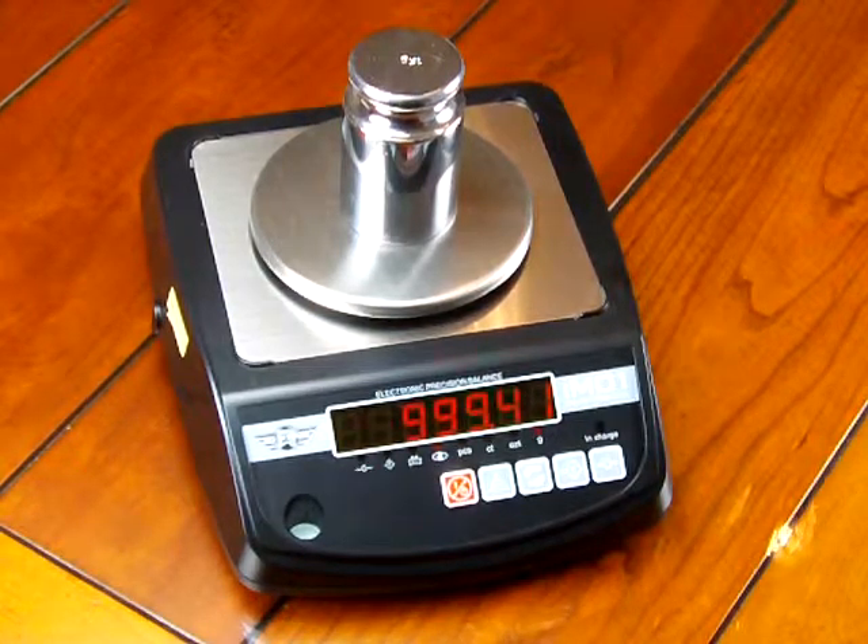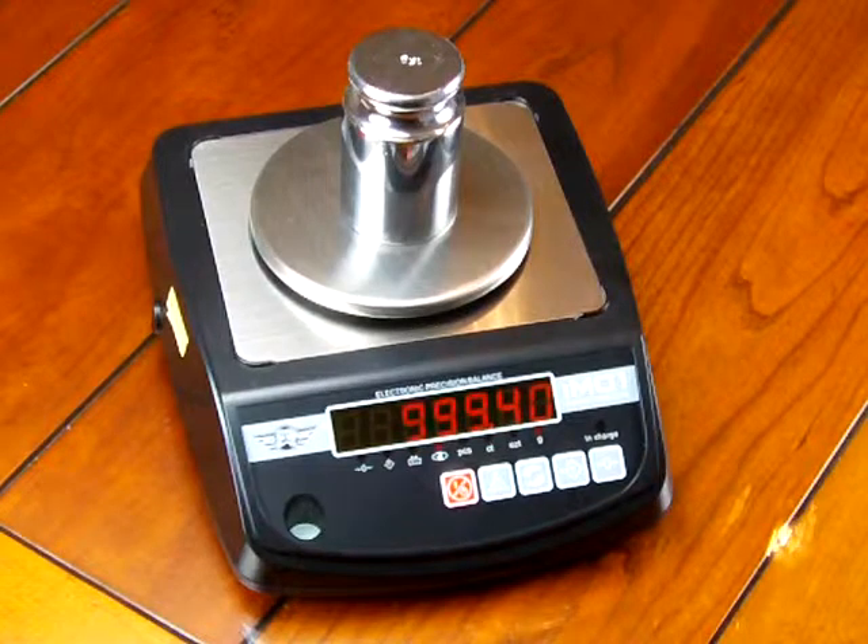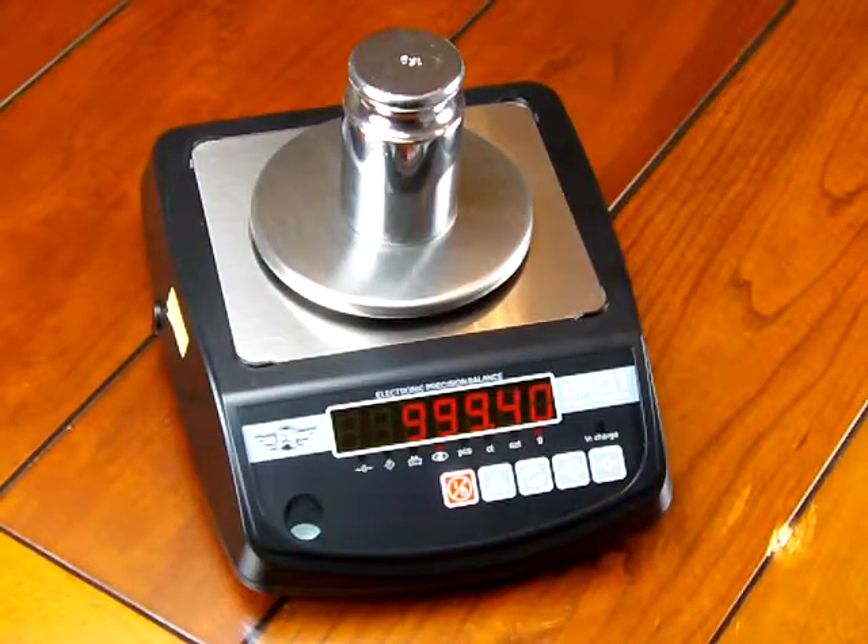Every scale in the world, when manufactured — and this one is manufactured in China — has a different acceleration of gravity versus here in Massachusetts where we're doing this video. So the acceleration of gravity is different everywhere in the world. The scale is by no means defective; it just needs to be calibrated. We highly recommend you buy the calibration weight because it's only a matter of time before you get a notice that your scale is off and you have to calibrate it.